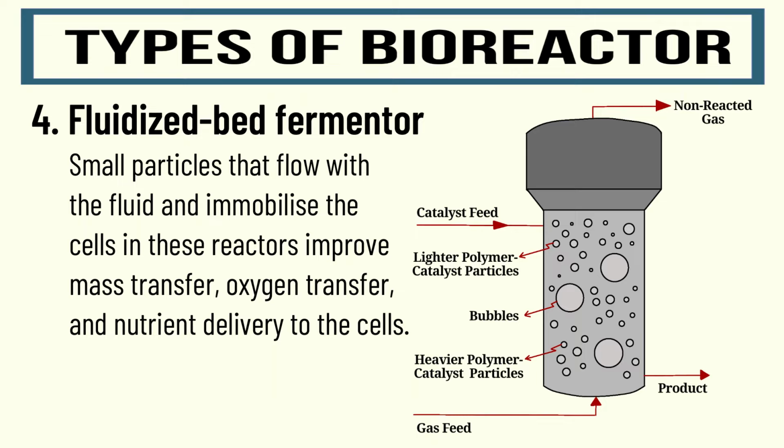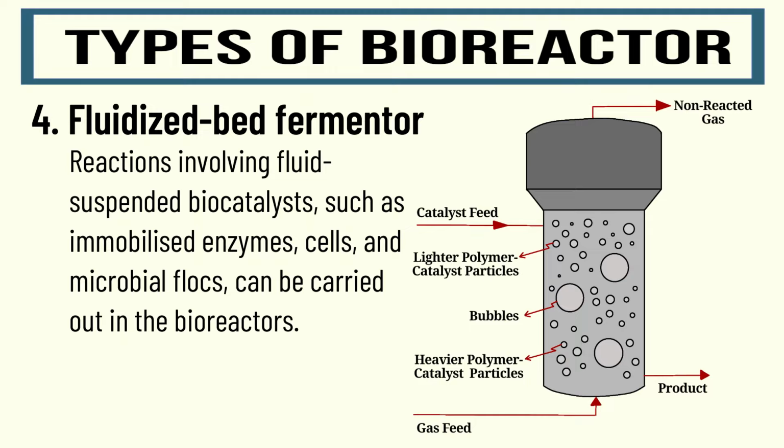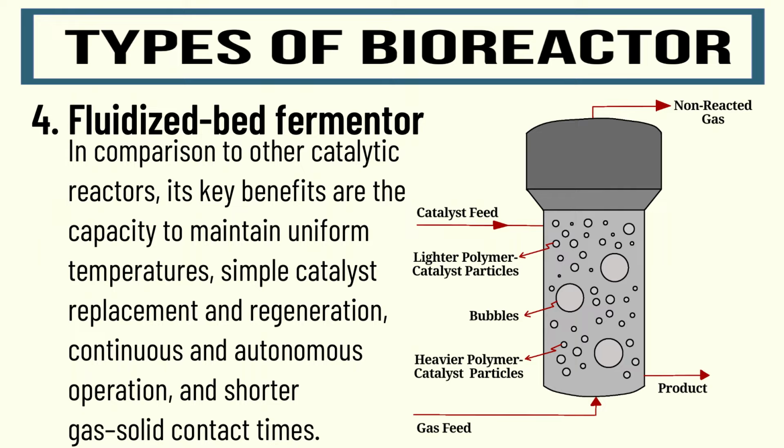Reactions involving fluid-suspended biocatalysts such as immobilized enzymes, cells, and microbial flocks can be carried out in the bioreactors. In comparison to other catalytic reactors, its key benefits are the capacity to maintain uniform temperatures, simple catalyst replacement and regeneration, continuous and autonomous operation, and shorter gas-solid contact times.